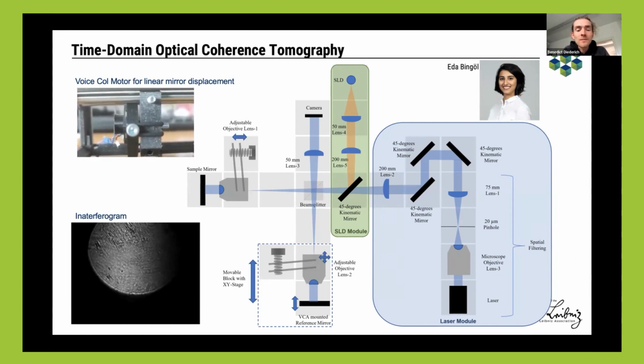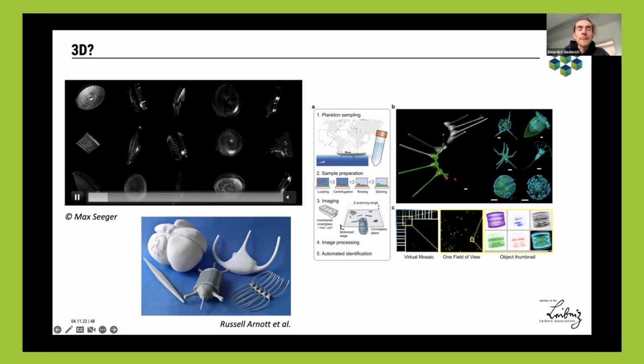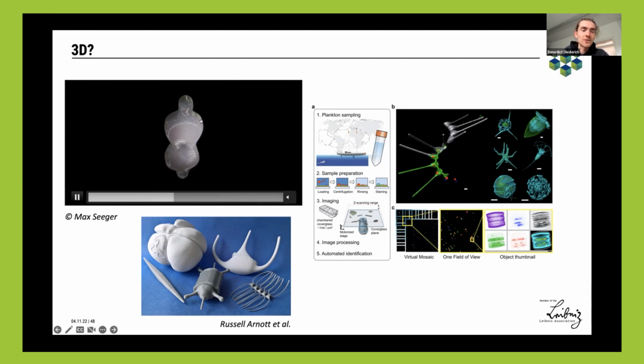And one other case where this modular system is very, very powerful is when you want to create new systems very, very fast. So recently I joined Manu Prakash's lab in Stanford for a short visit, and there we were asking ourselves the question, how could we image plankton? And plankton is very diverse. You can see that everywhere on Earth, there's even a mathematical formula to define the structure of what you see here.